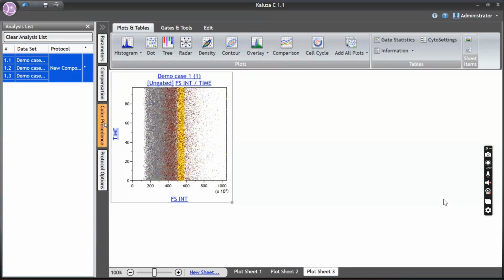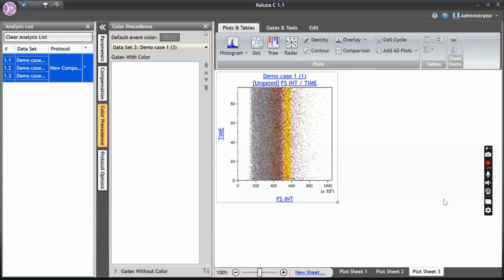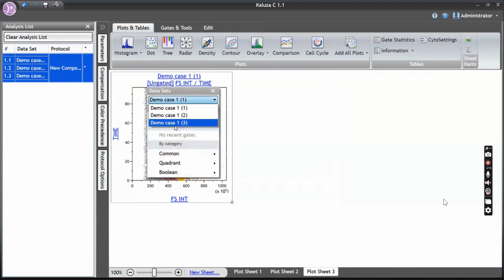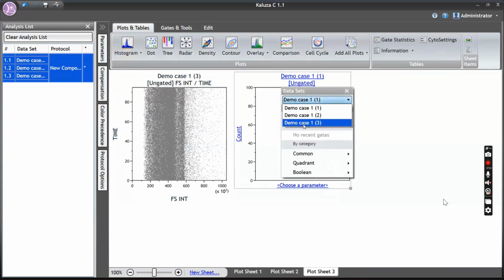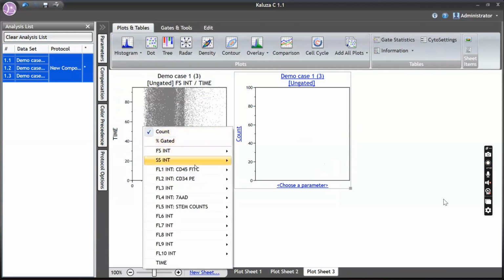So you find that there is some stable acquisition. Okay, there is stable acquisition. Second plot. Viability. No, before that, singlets. Okay. Correct? Okay.